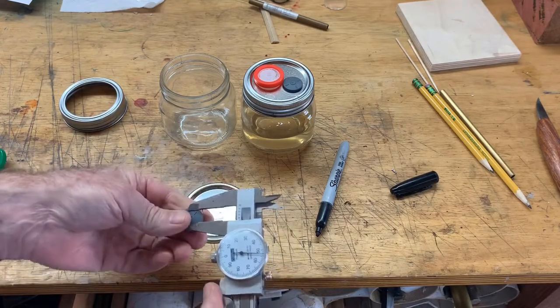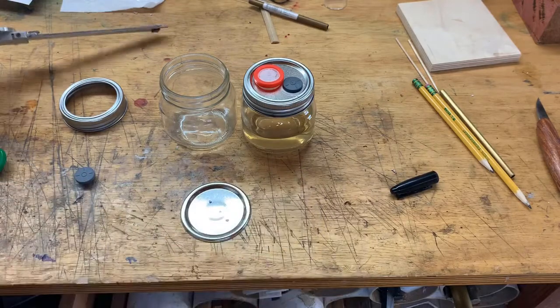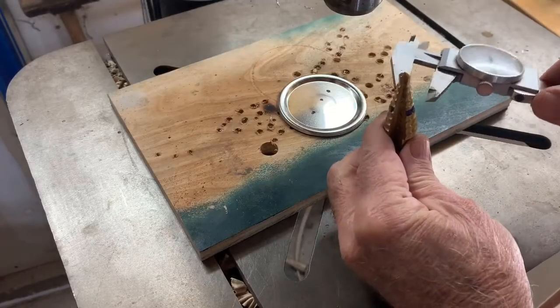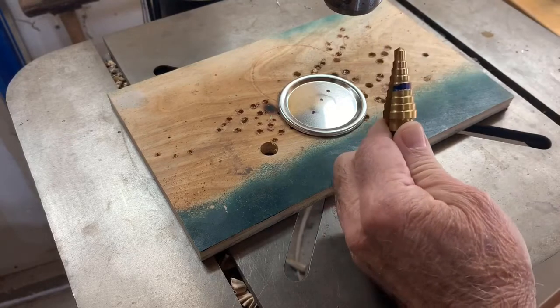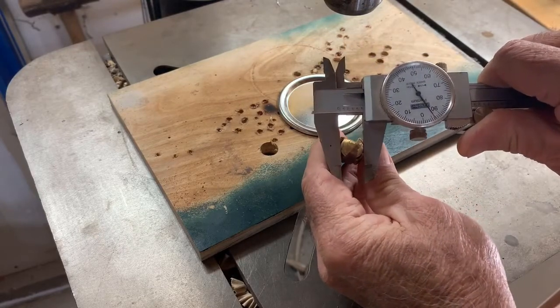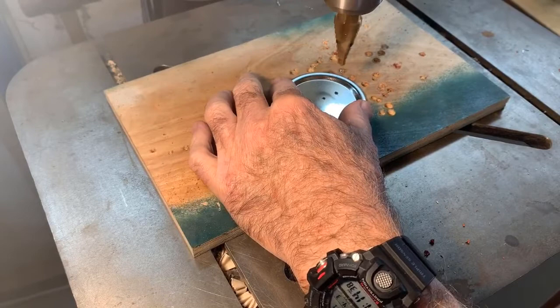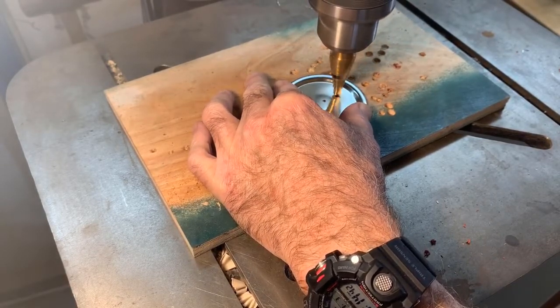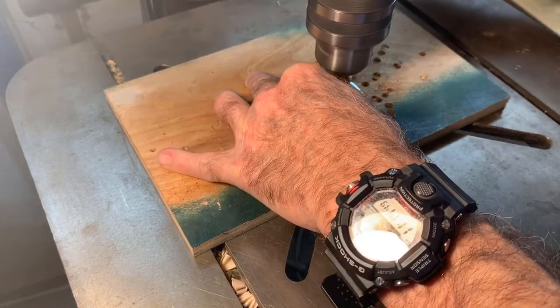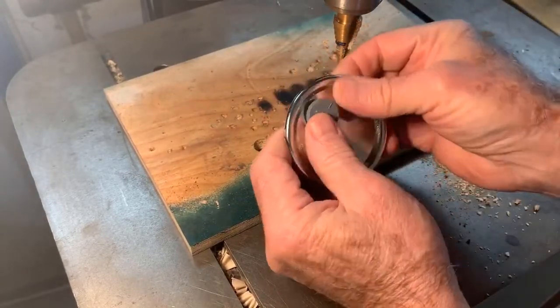I'm going to go 0.45 inches from here to there, and it works. Now we'll drill some holes. These step drills are really nice things, and I've marked the ring that steps to a half-inch diameter. I'm going to use that for the injection port. And that's the hole for the injection port.